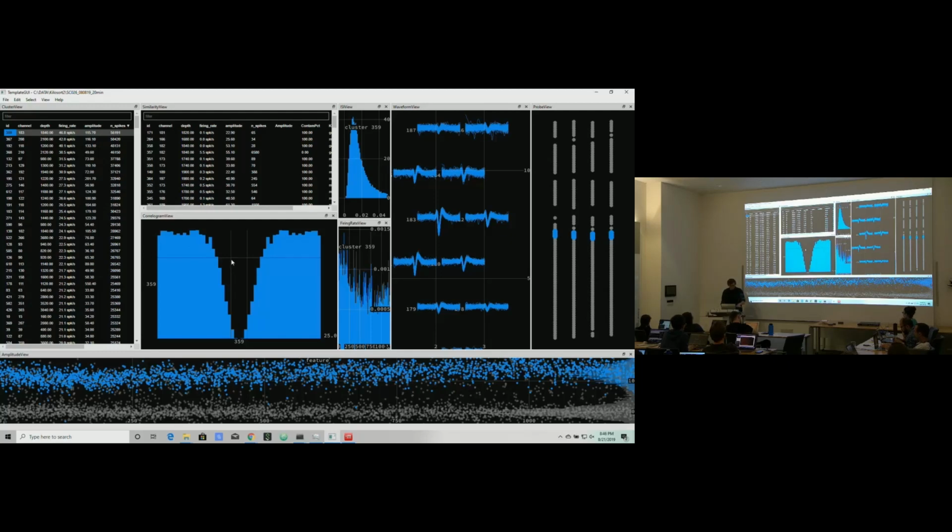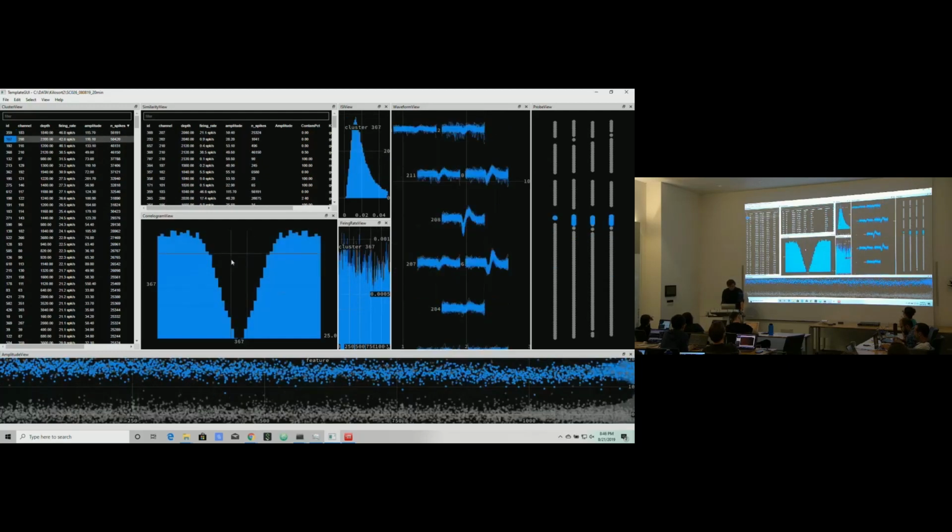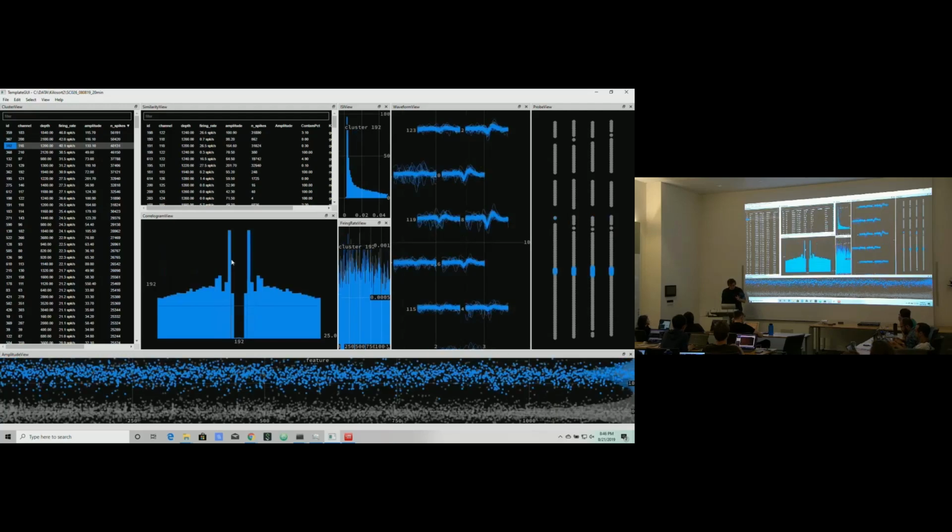So let's start going through them. Now let's just focus on the autocorrelogram for now. I'm just going to scroll through pretty quickly, unless I find something interesting, and then we'll stop. So here's a pretty bursty one. It has this burst at exactly this, probably like 2 millisecond interval. So it tends to almost always fire once more after it just fired.